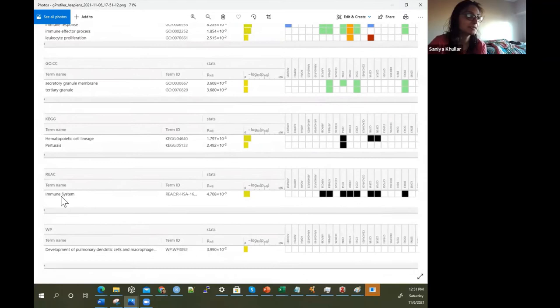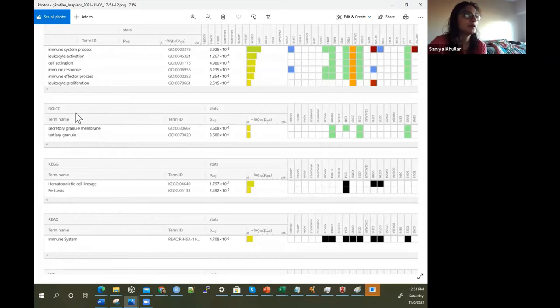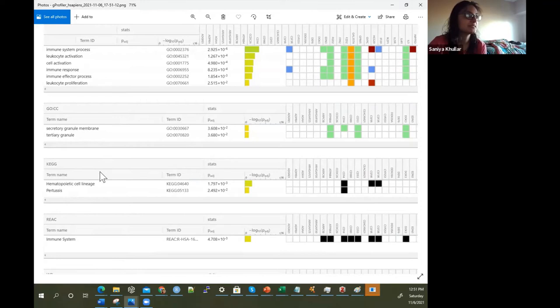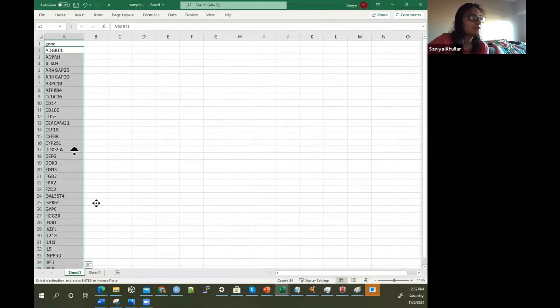We can see that those 34 genes are involved in the immune system, development of pulmonary dendritic cells and macrophages, secretory granule membrane, tertiary granule, hematopoietic cell lineage, pertussis, immune system process, leukocyte activation, cell activation, immune response, immune effector process, and leukocyte proliferation. There's just a lot of those that are out there.